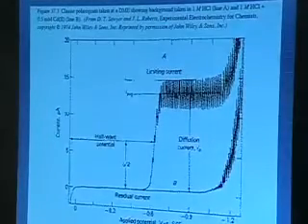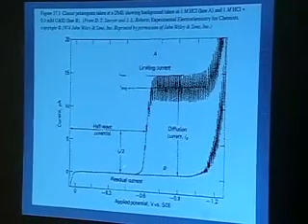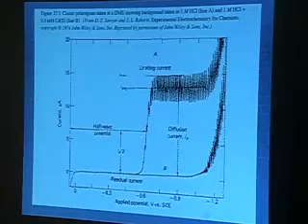So here's one. In fact, this one's very good also. But this gives you a little bit more of a feel for what's happening. And this is taken out of a text here. But you see, as the current gets bigger, you get a little bit of jiggliness as the current rises. But once you get into this plateau region, there's a lot of jiggling going on here.